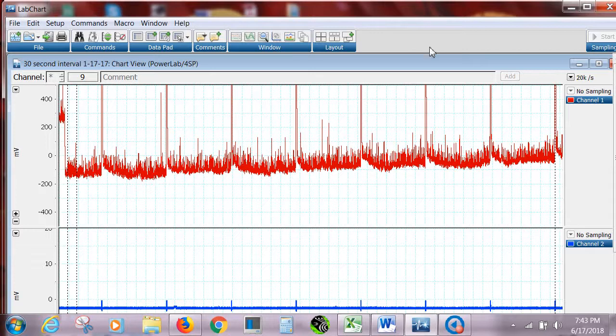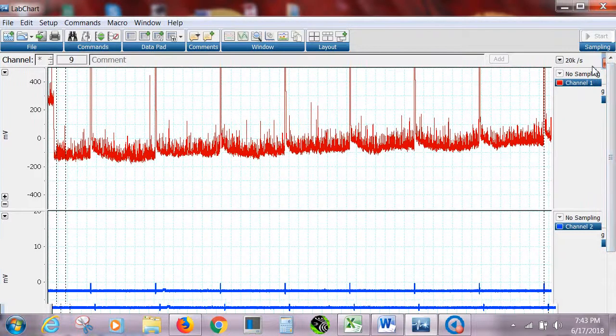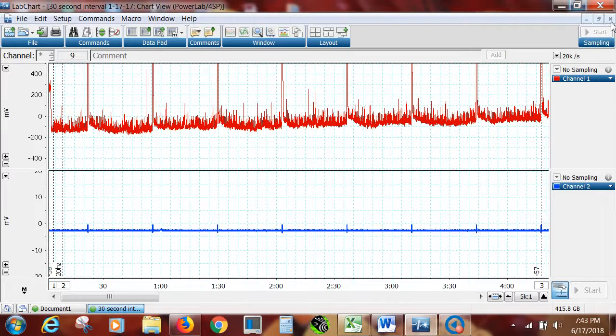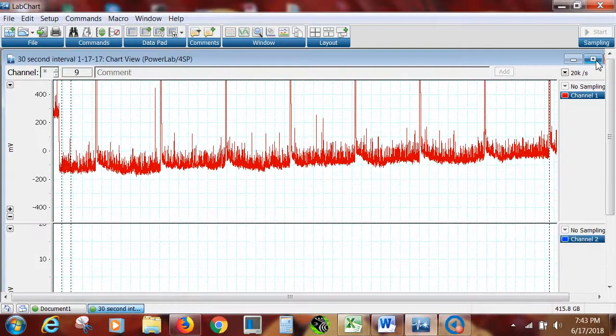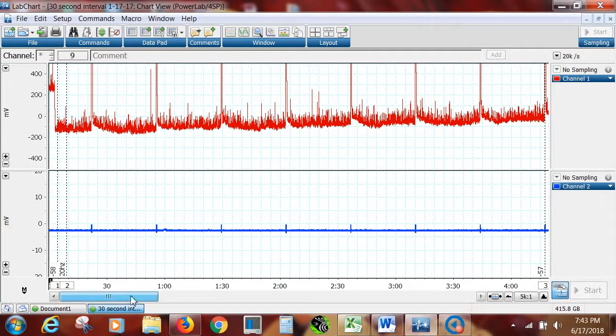Then you see this chaos. We might have to adjust the screen a little bit. Sometimes the software is a little bit odd, so you have to decrease it and increase it to make it work the way you want. It might even help just to write it down on paper, instead of just going back and forth with the Excel sheet. But you can see the stimulations here. Let's go through this file a little bit.